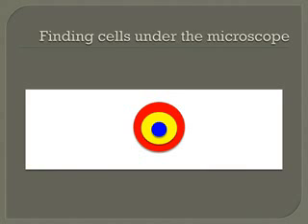If you're ever looking at something underneath a microscope under low or high power objective lenses and then for some reason things get out of focus or you get lost, the best bet is to go back to the scanning power objective lens and put things into focus again.